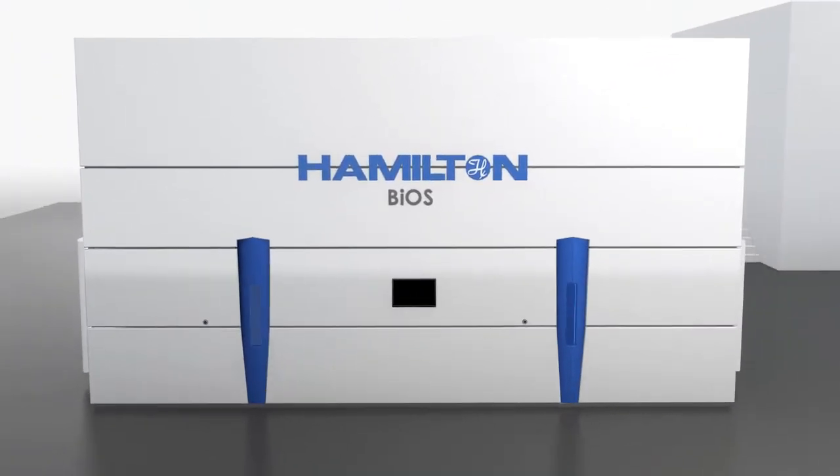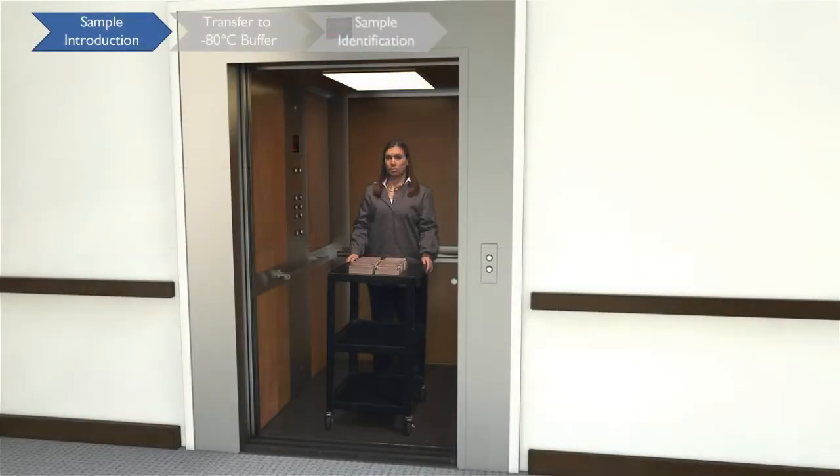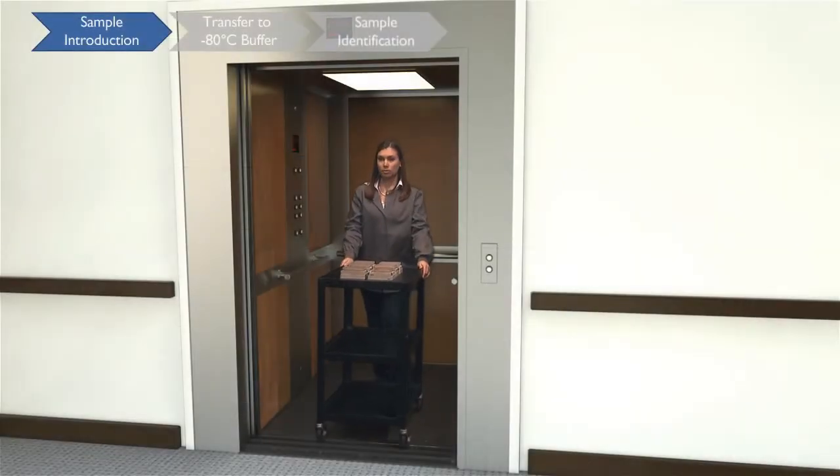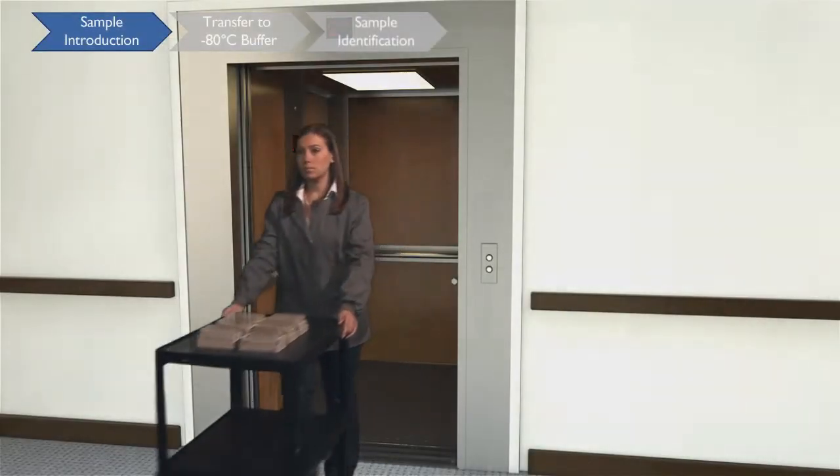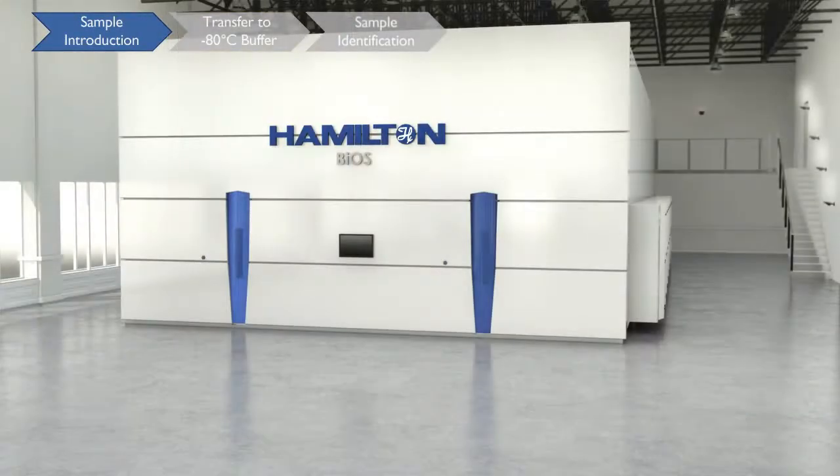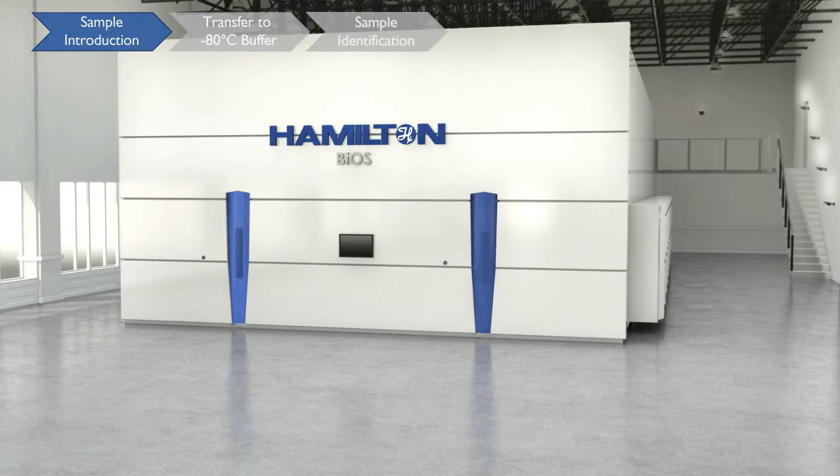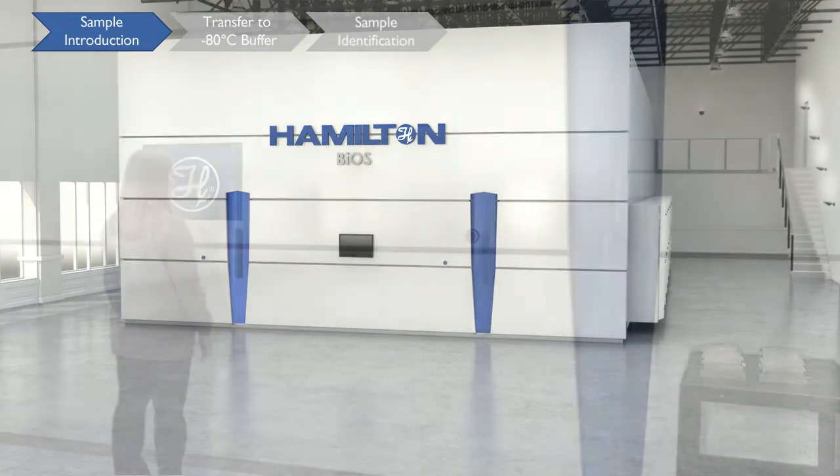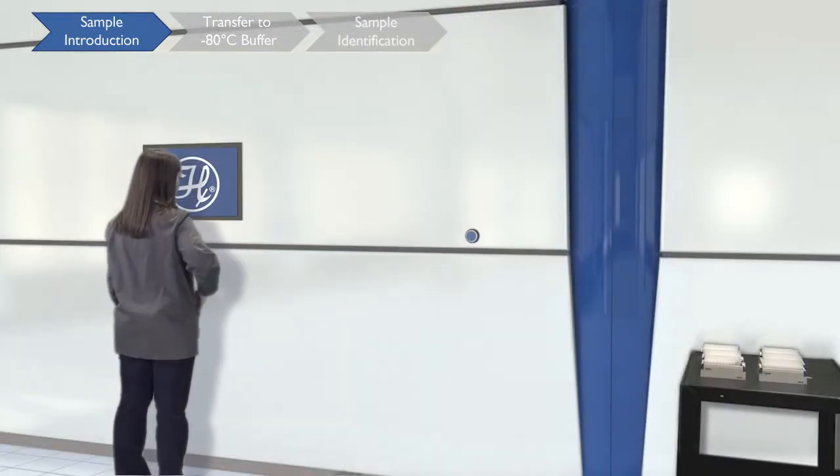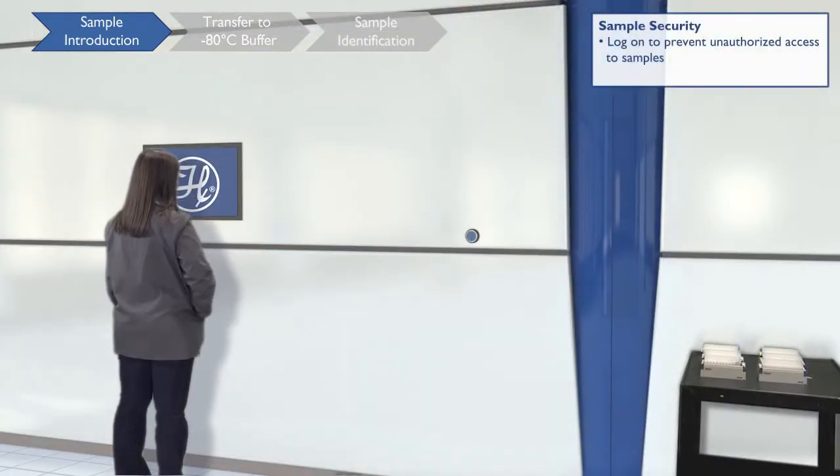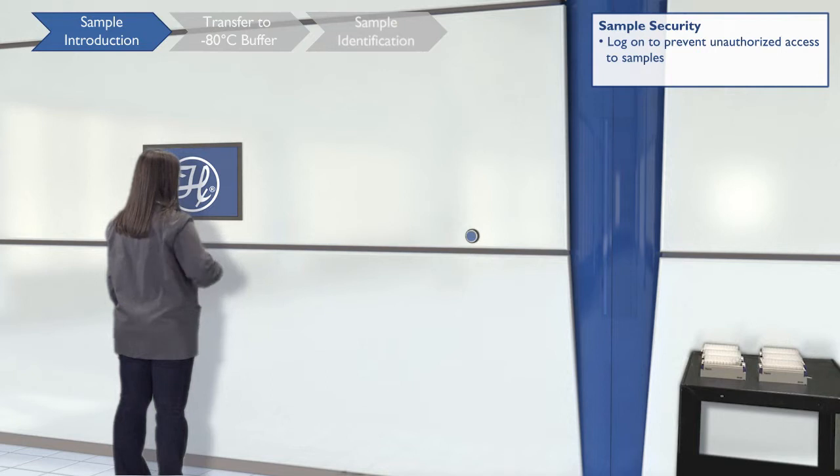This video will guide you through your standard workflow of using BIOS to load and retrieve samples. Log on to BIOS to prevent unauthorized sample access and maintain a full audit trail.